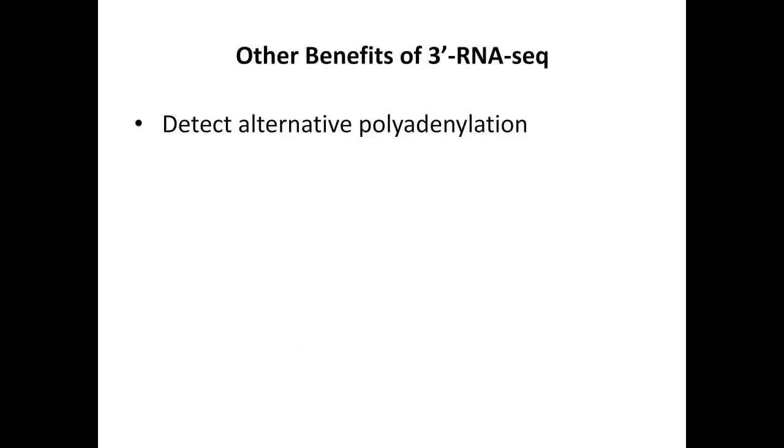Another benefit besides cost saving. There are other benefits of 3' RNA-seq analysis. One of them is to detect alternative polyadenylation.